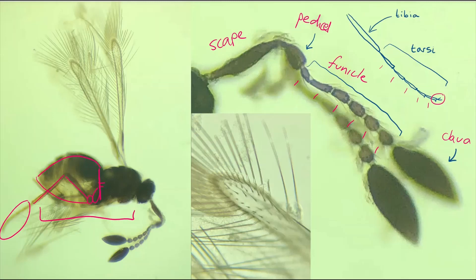Using the other key, I'd use the same features but a different permutation, as well as details of the wing venation and wing length. This species is fully winged, as you can see, and the wing venation — consisting mainly of this basal vein — does not extend beyond 50% of the wing's length.